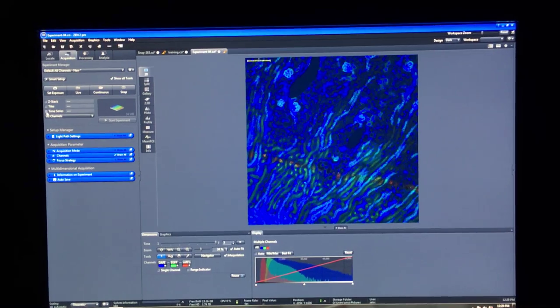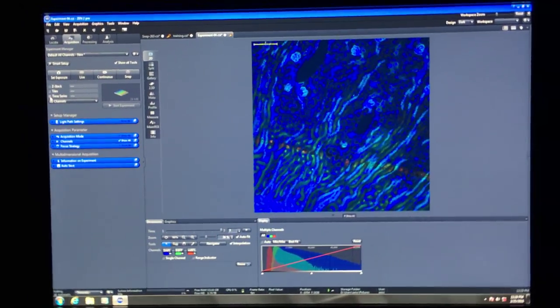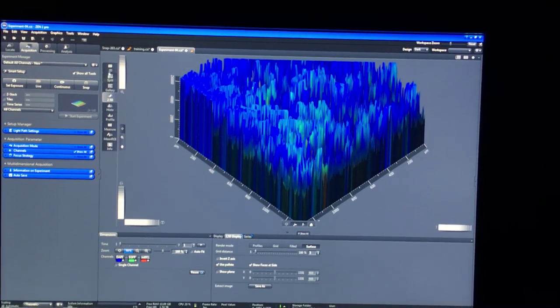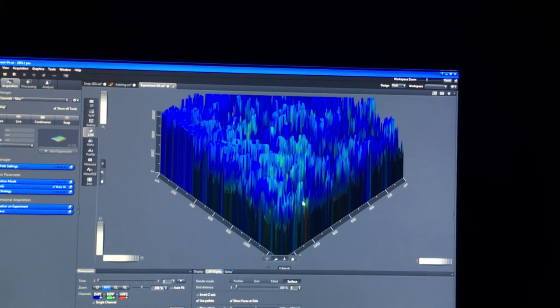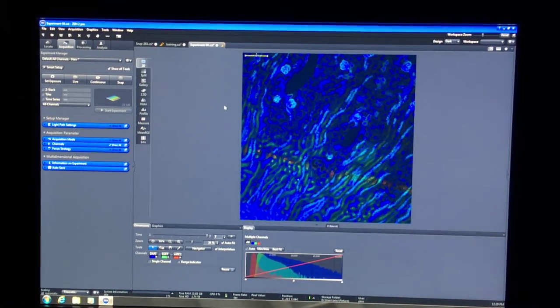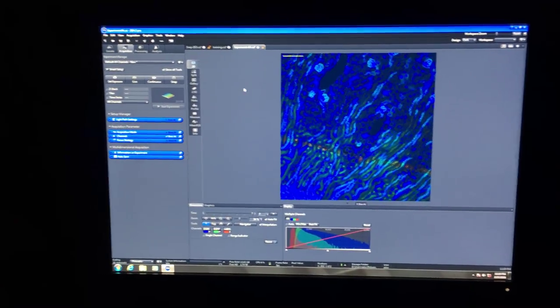We'll touch on other aspects once you have real samples. For 3D rendering, you haven't done a z-stack yet so there's nothing to show—once you learn how to do a z-stack you can use the 3D function to render it. Be careful, don't break anything, call me if you have questions, and let me know when you're ready for the humidifier.